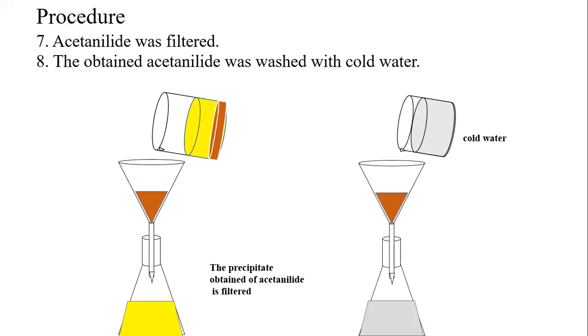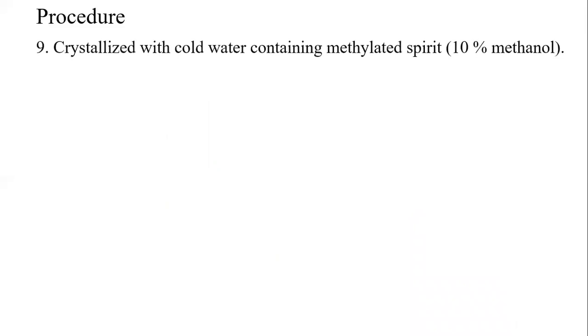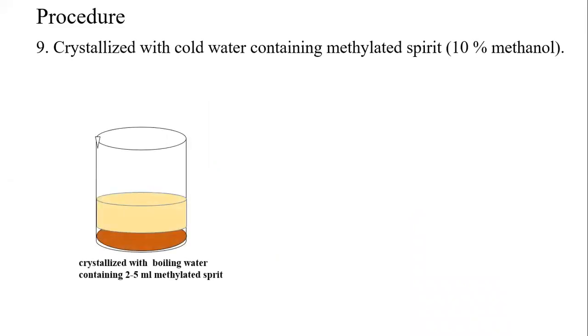It will now be washed with water. The same funnel will be taken out and we will keep it over another conical flask and will pour cold water over the separated acetanilide.